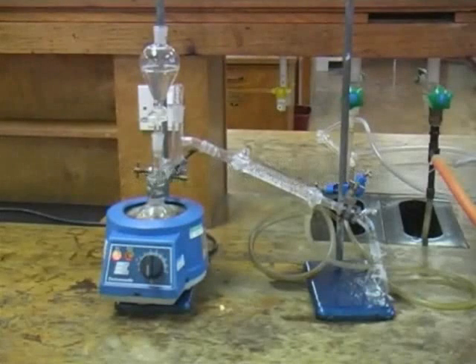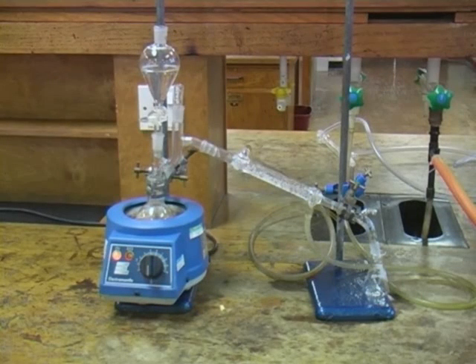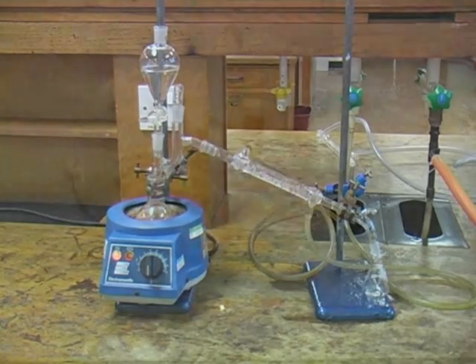Steam distillation is typically used to extract natural oils from plant material. It should be noted that there are a number of different methods for carrying out steam distillation, so make sure you know what you are expected to do before starting your experiment.